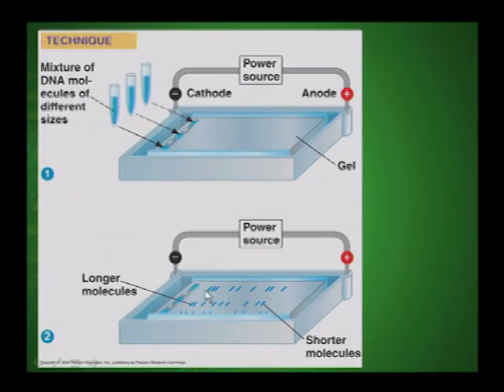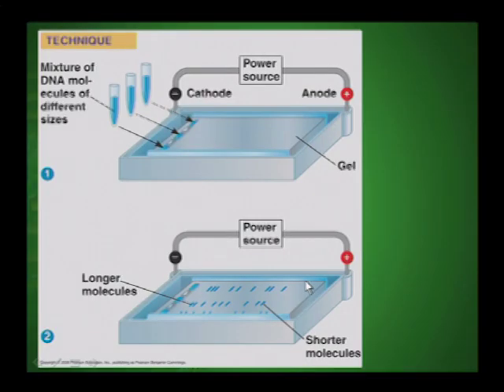And again, the nice thing about this is that when we run a traditional DNA fingerprint using the restriction enzyme techniques, you end up with thousands of different bands. But in PCR, you'd be amplifying specific genes rather than thousands of genes. You'd just be targeting specific genes. And so anyway, it can make for a simpler type of amplification, and you won't necessarily have as many bands. And in some cases, again, you don't even necessarily need to use probes in some of these situations. It just kind of simplifies the whole process.